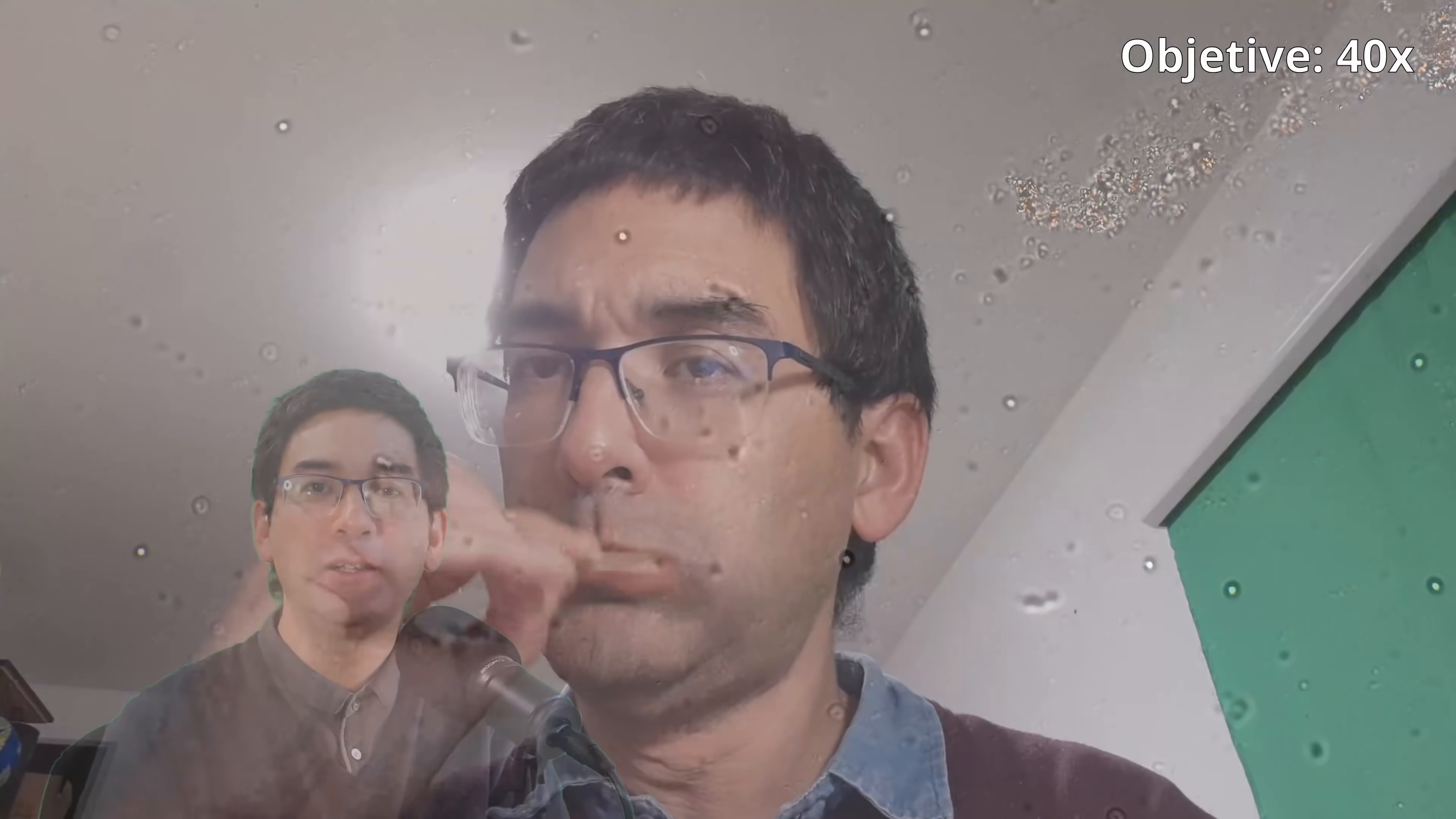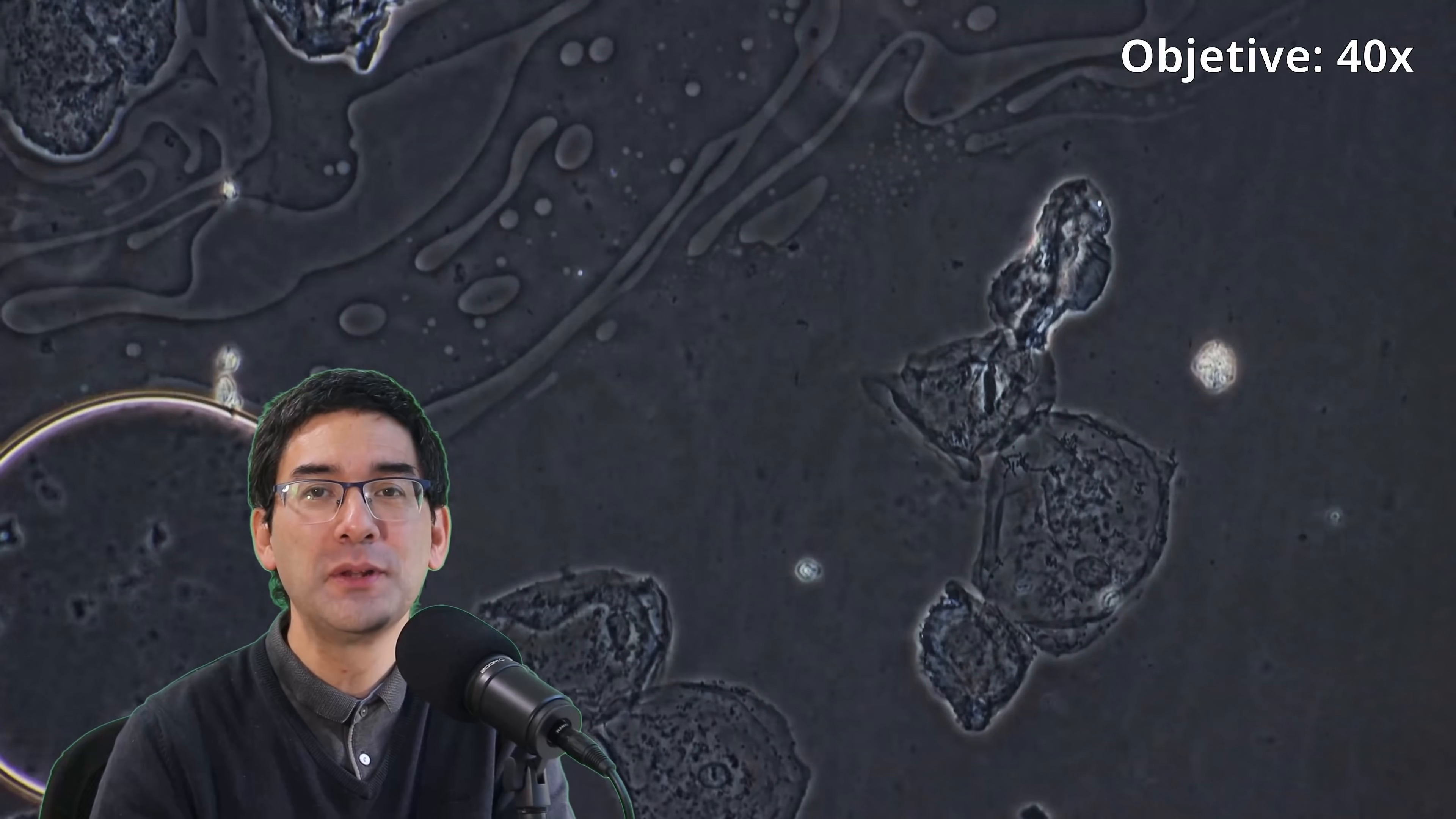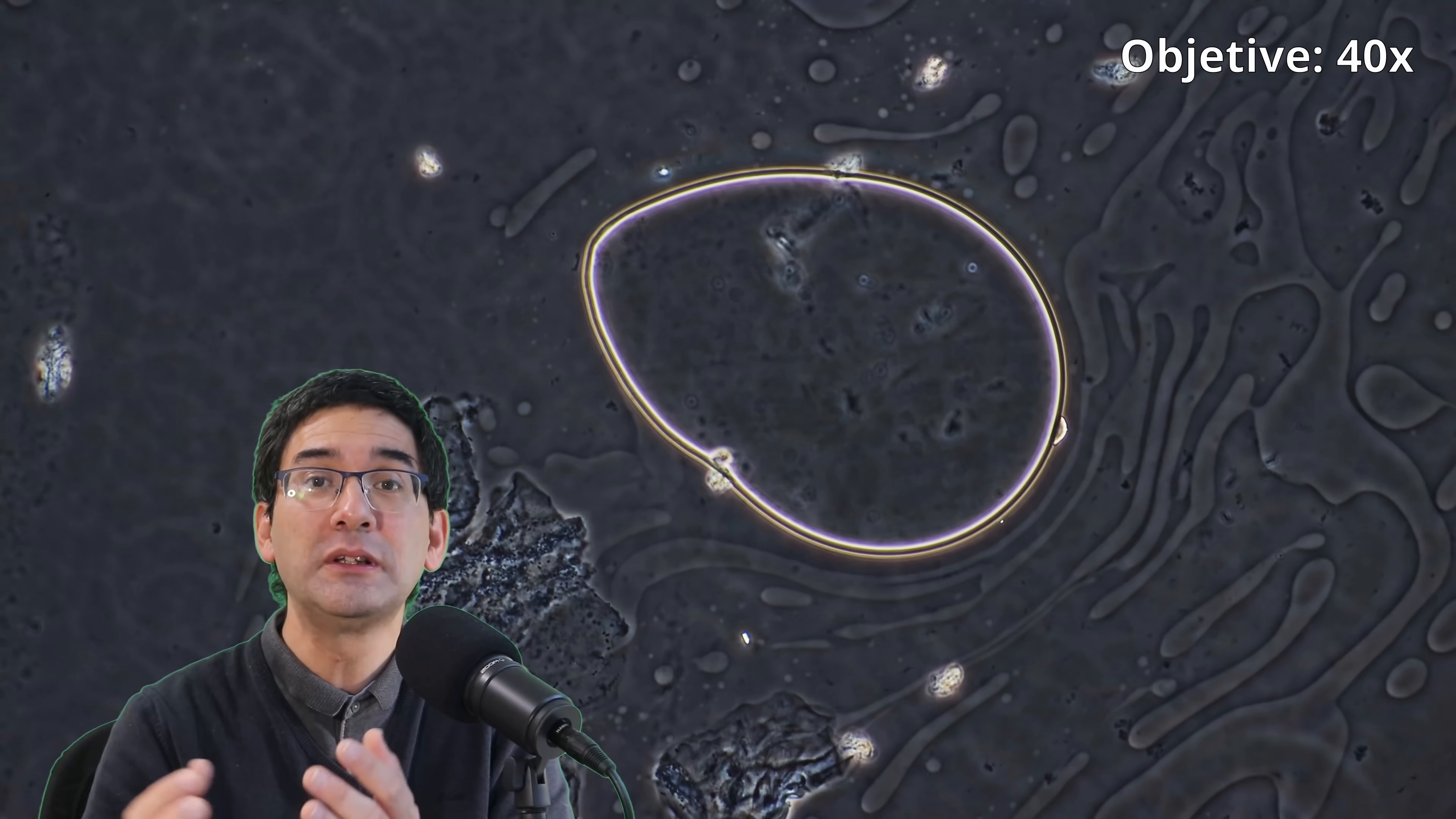I also wanted to check the effect of the buffer solution on human cells. I have taken a small sample of cells from the inside of my mouth using a toothpick and mixed it with the buffer solution in phase contrast. Here you see a gigantic air bubble - just ignore that. You can see that the buffer solution is now moving upwards. You also see the very flat epithelial cells. What happens to them? I was a little bit disappointed. Nothing happens to them. They're so stable that they don't break open.